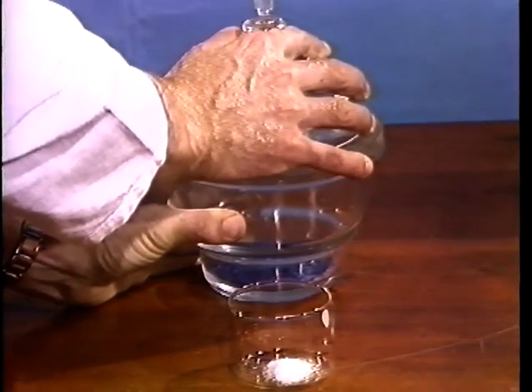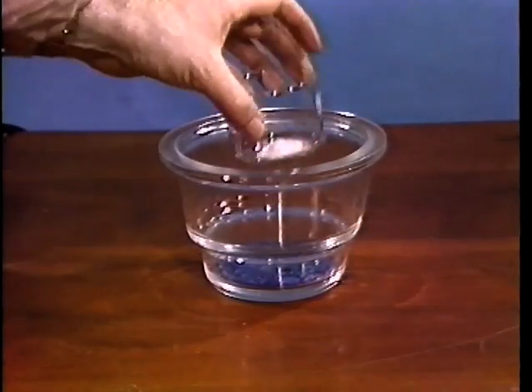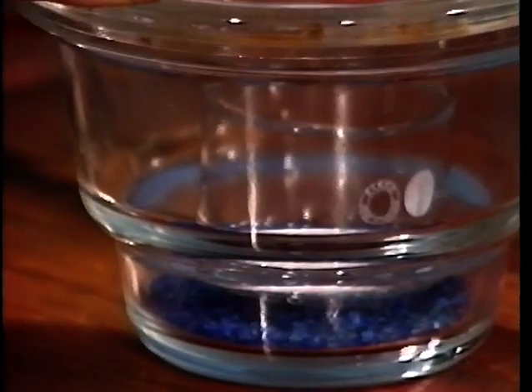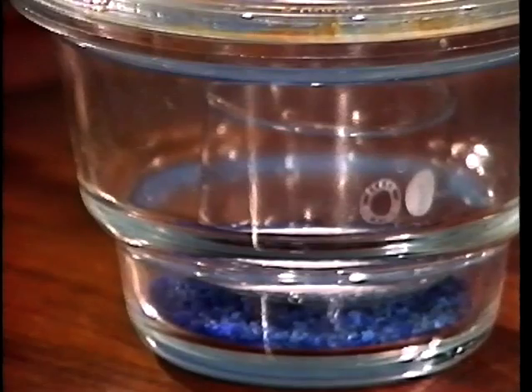Open carefully a desiccator. Put the crystals in the dish inside the desiccator, slide the lid back on, and leave the crystals to dry overnight.